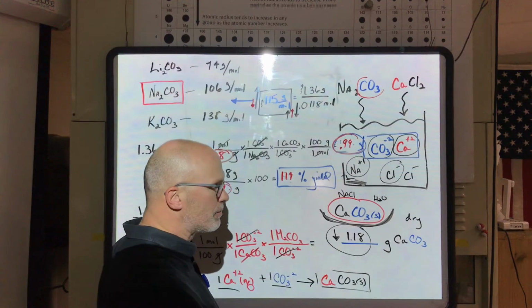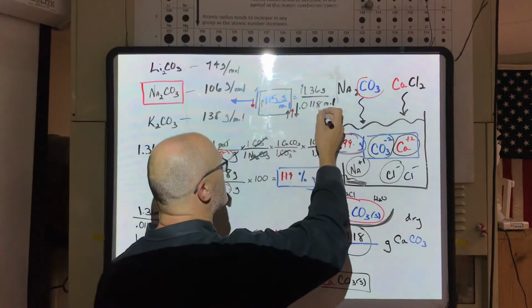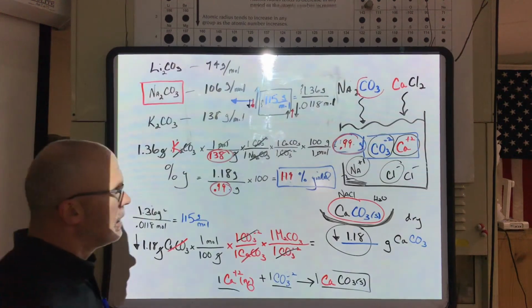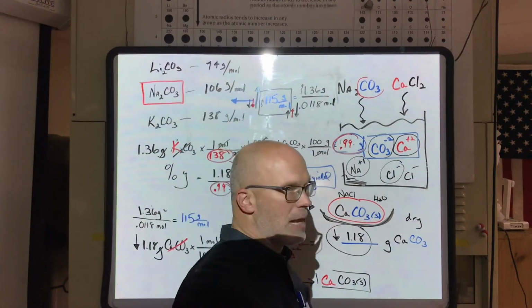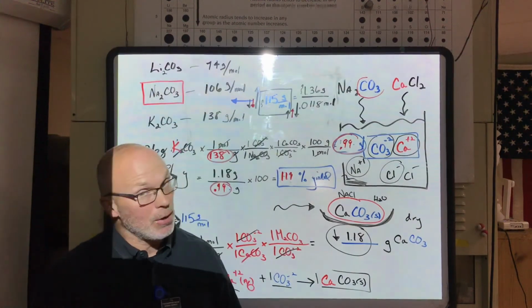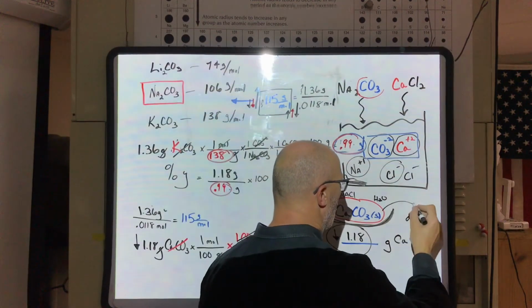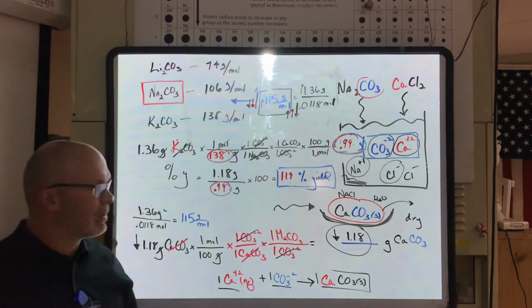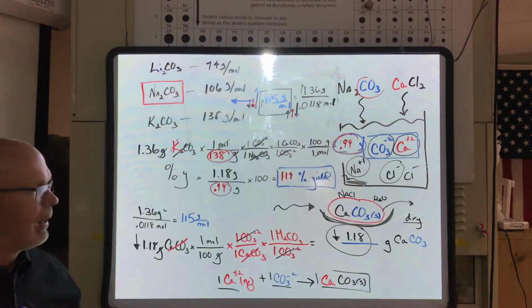Subtracting out the filter paper, you're going to have a larger difference because you're adding more mass, and that would drive the moles up and this down as well. So those are all things to think about. I will tell you that I did dry these very, very well. For those classes that had it overnight, it was dried overnight. There was one class that I heated during a 20-minute period using the microwave. And in the microwave, there was some splatter, loss of the precipitate. I was trying to get it done for that one period, so that could have been a case where there was still some water there, but something to think about.